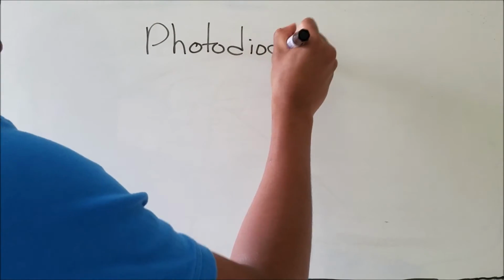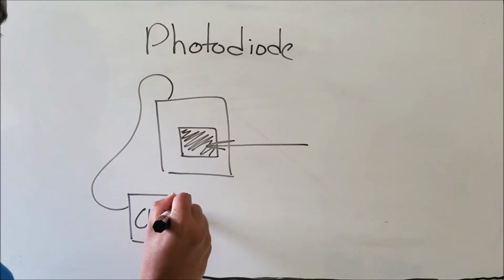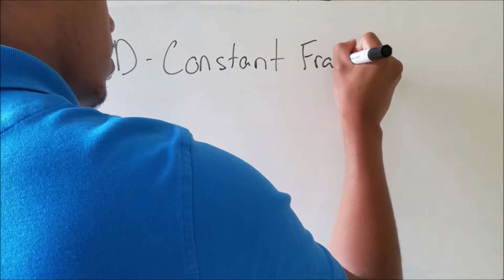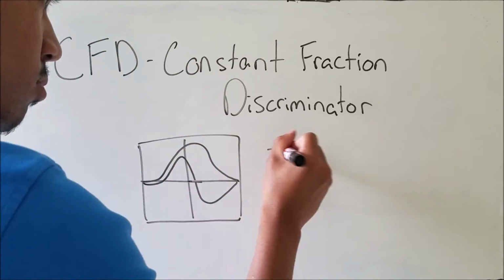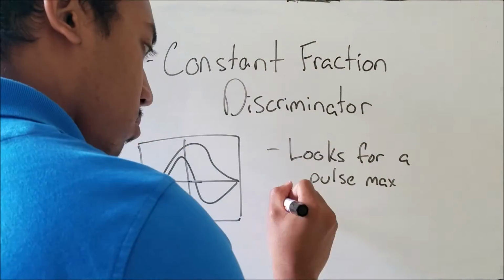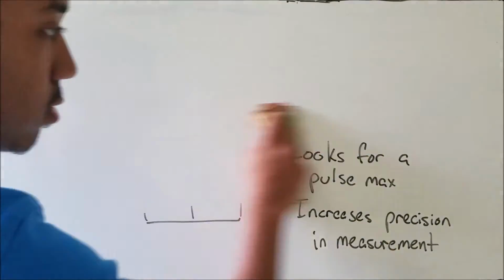Before the laser enters the monochromator, we send part of the light to a photodiode. This starts the clock to measure the time between the excitation and the detection of one photon. Attached to the photodiode, we have a constant fraction discriminator. This is a small box that is very important because unlike other lasers which output the same intensity, the pulses of a supercontinuum laser are very random. This helps increase the accuracy of the lifetime measurement.